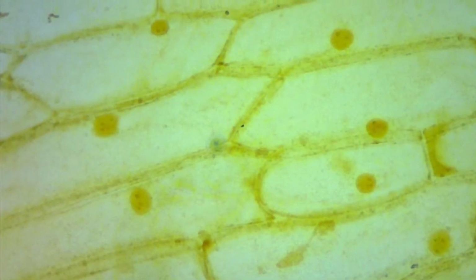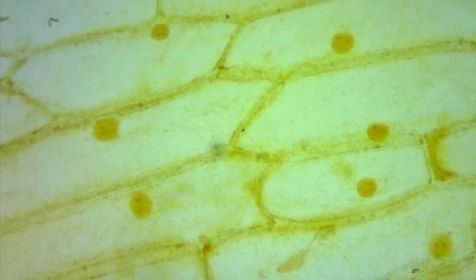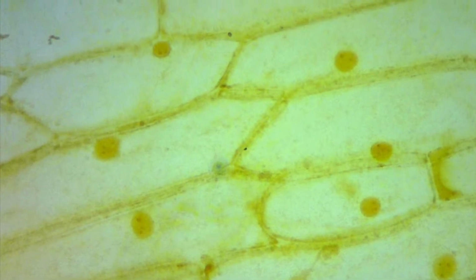As we continue viewing this picture, notice the cell walls, which are the outside border of each cell. The cell wall determines the shape of the cell. The potassium iodide or Lugol solution has stained it brown.